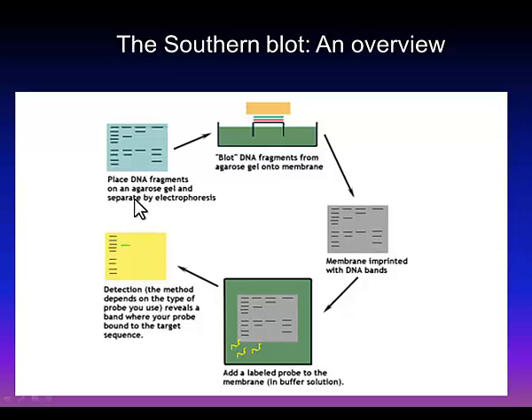And so E. coli are what are called coliform bacteria that inhabit the colons of humans. So it's not surprising that their optimal temperature would be near body temperature. Anyway, the restriction enzyme digest is done overnight, and then in the southern blot, the fragments would be loaded onto the gel, and you would have one lane or one well per sample that you were interested in, and then this sample would be allowed to run.